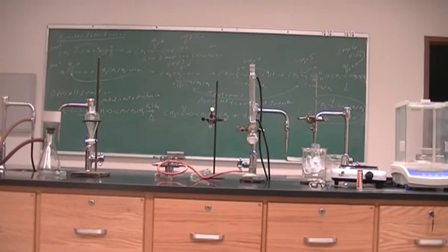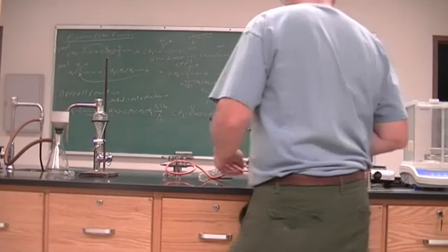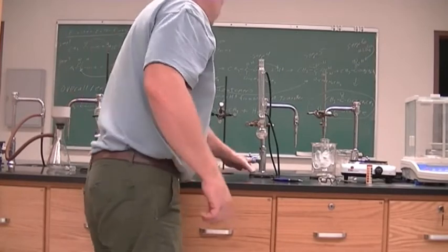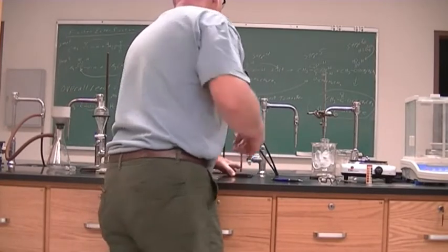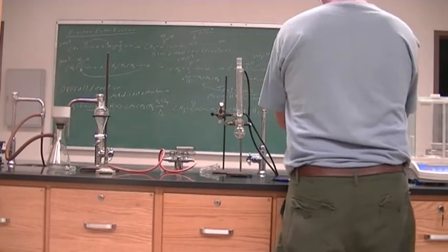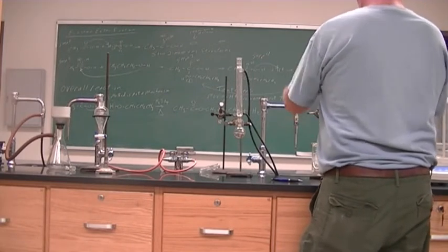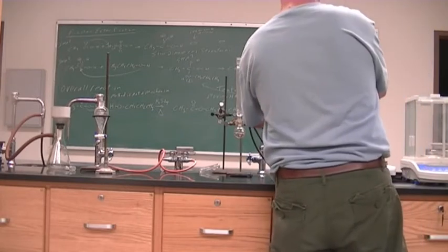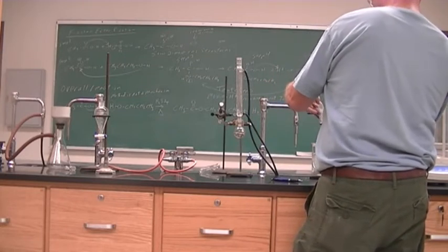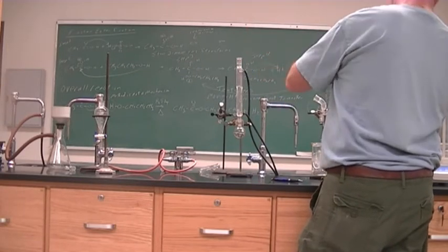And so now we have our next step. So I will remove the heat. I will get this ready for a distillation. So this is a simple distillation, and the only reason why they call it a simple distillation is because we are not going to do any sort of fractional distillation, where you would need a larger setup, you would need two condenser tubes, one that goes up and then one that comes over.